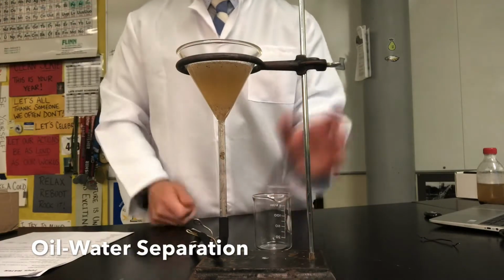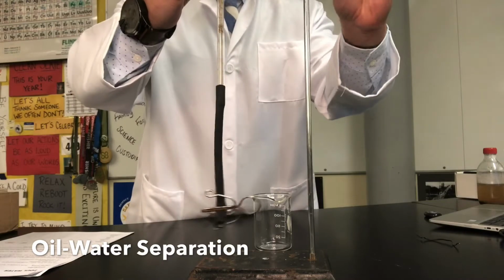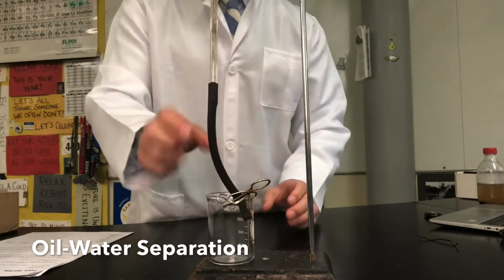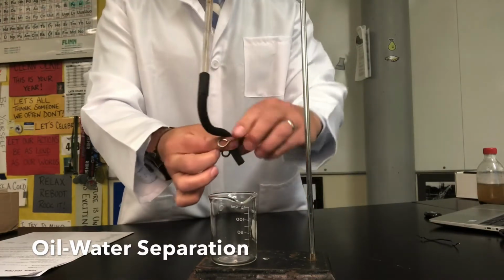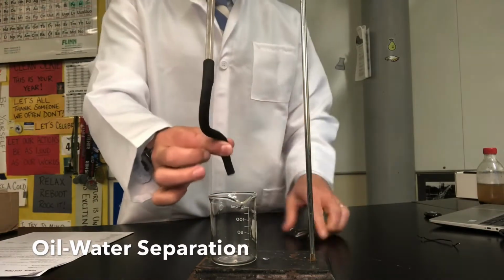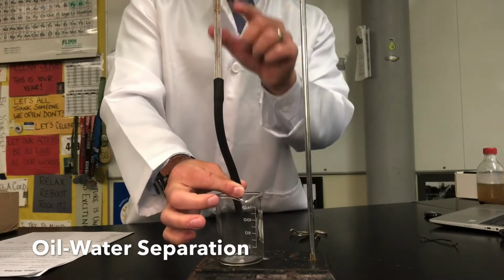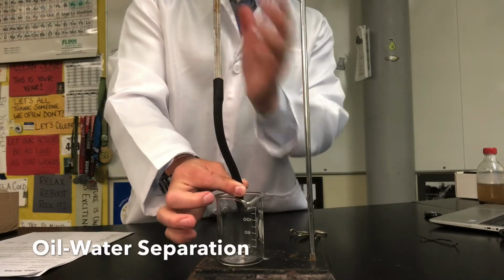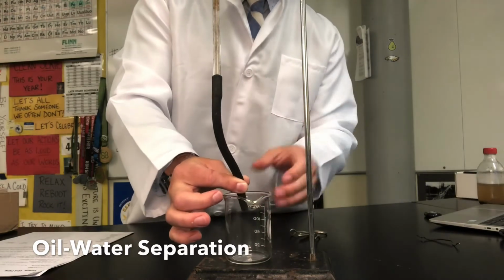So what I'm going to do is take my ring stand and raise up my funnel a little bit. I'm then going to put a clean beaker of water underneath here, and I'm going to pinch shut and unclamp this. What I'm going to do is slowly let out the water and drain it out, but as soon as I get towards the bottom here with the oil, I'm gonna pinch it shut and separate the oil out. So that's the whole idea of this physical separation.